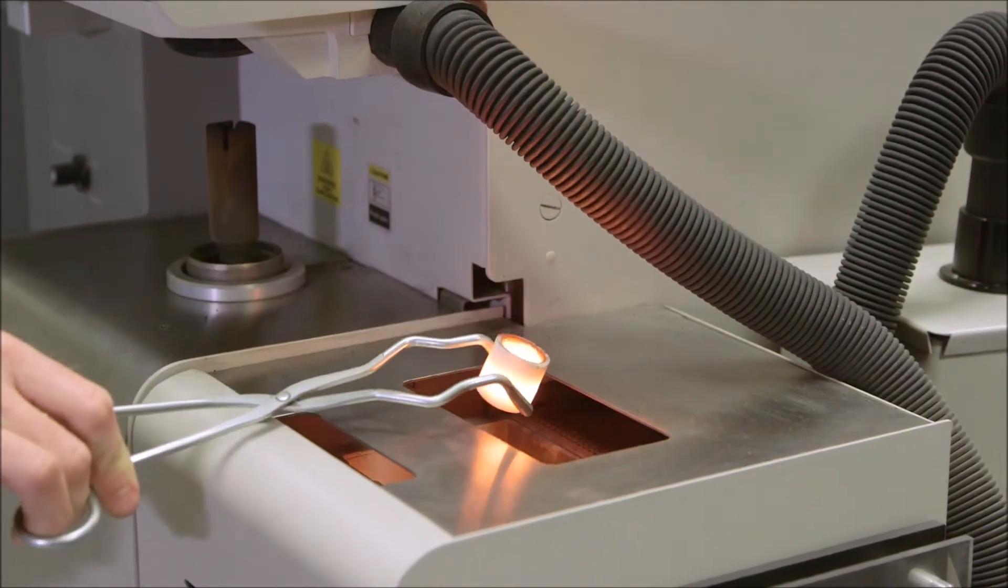Another important part in our carbide coatings and within our steel is what is the carbon percentage. The carbon is the major element that leads to providing the hardness and the strength and the abrasion resistance that our products are going to contain.